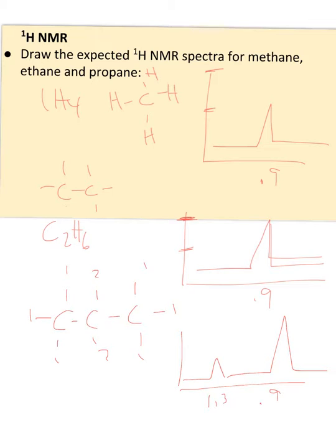peak there. And when you're comparing the height of the peak or absorptions, sometimes they talk about an integrated line to look at. That would look something like that. And again, you're looking at this space compared to this space when you're looking at that.